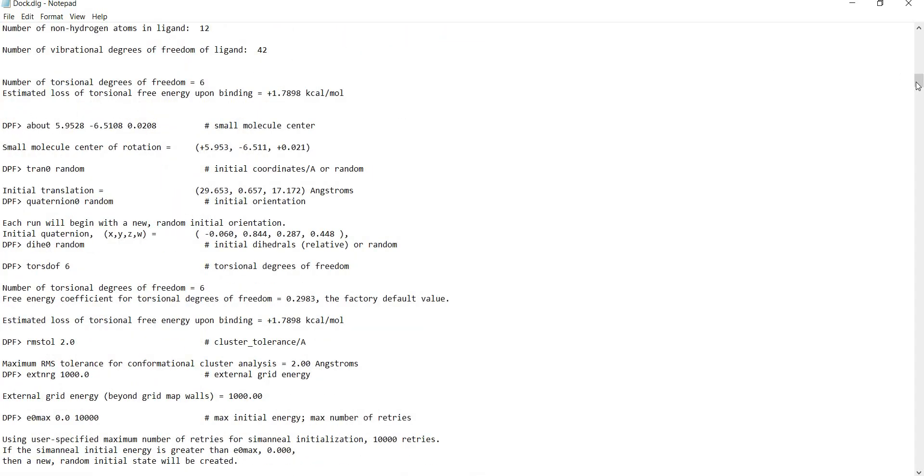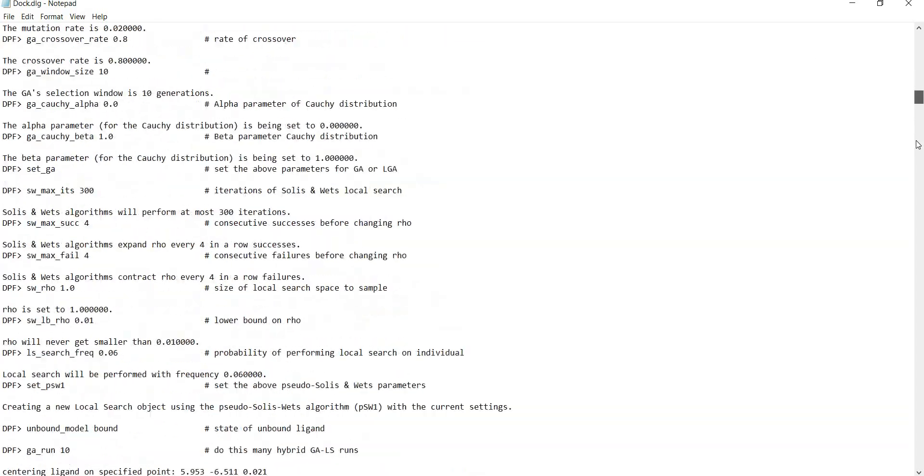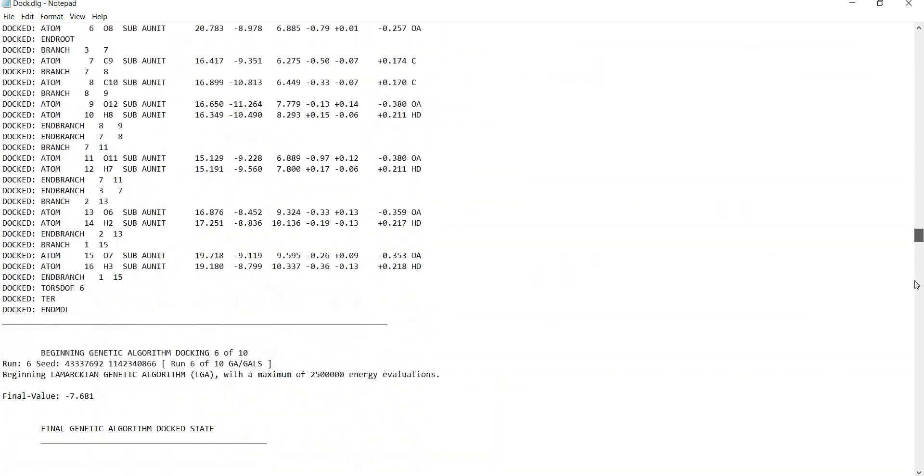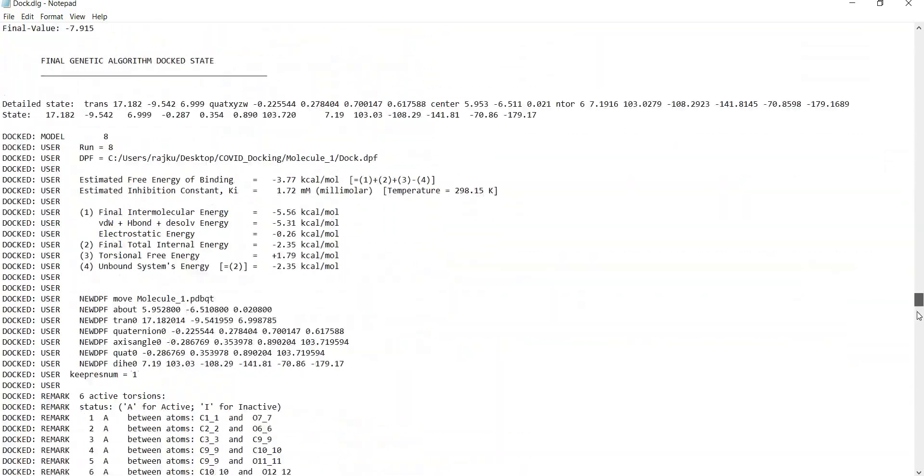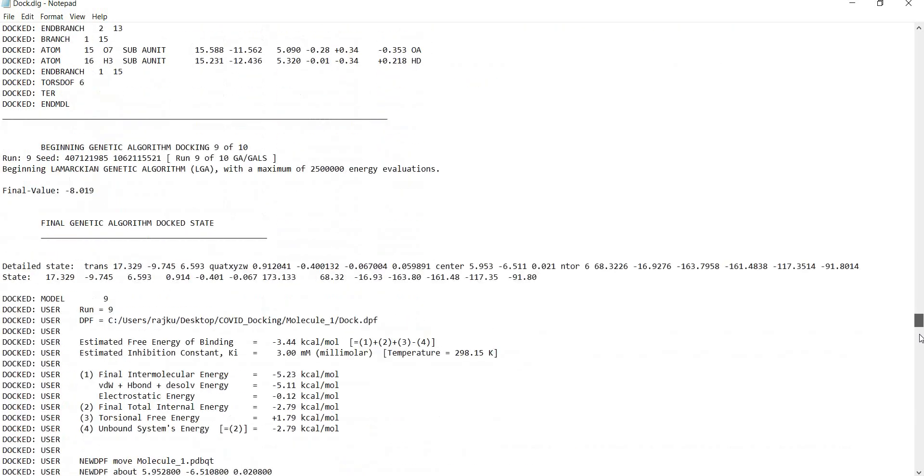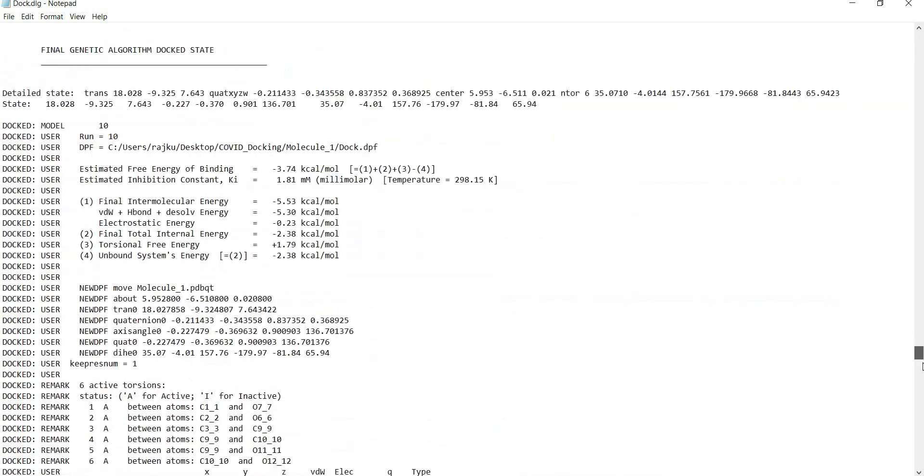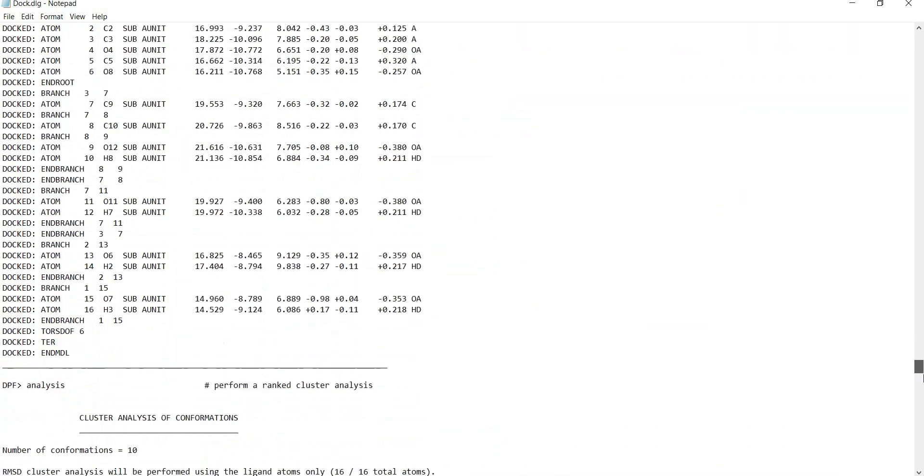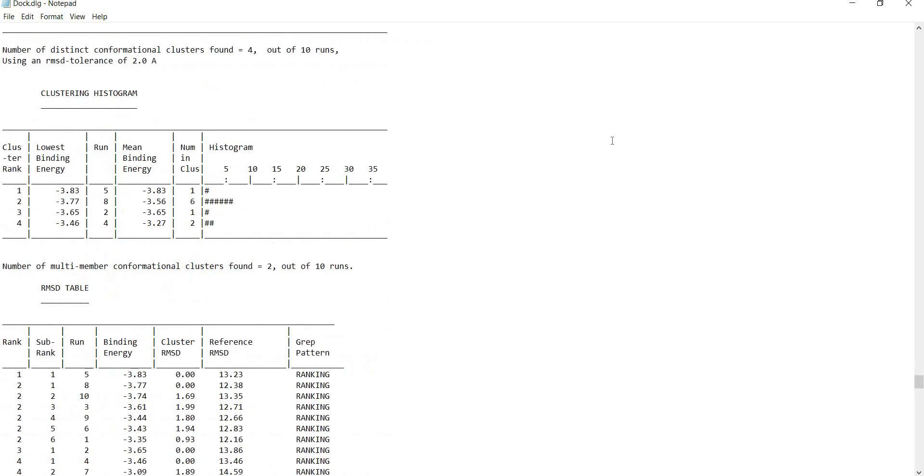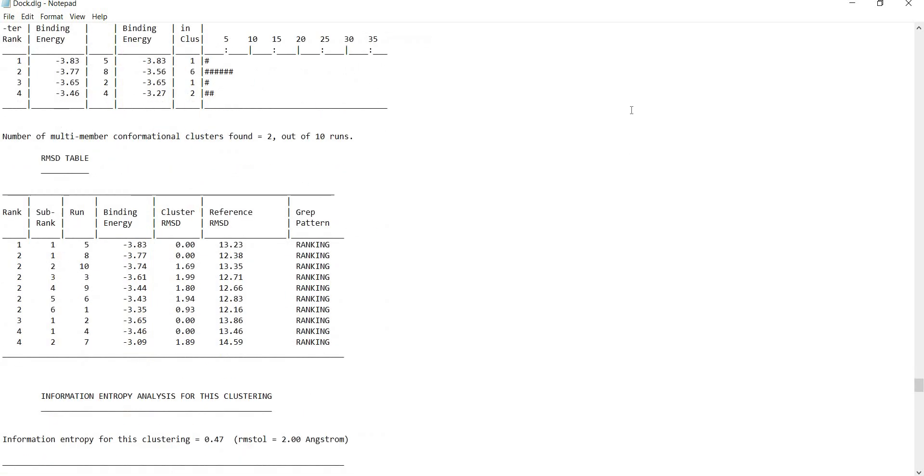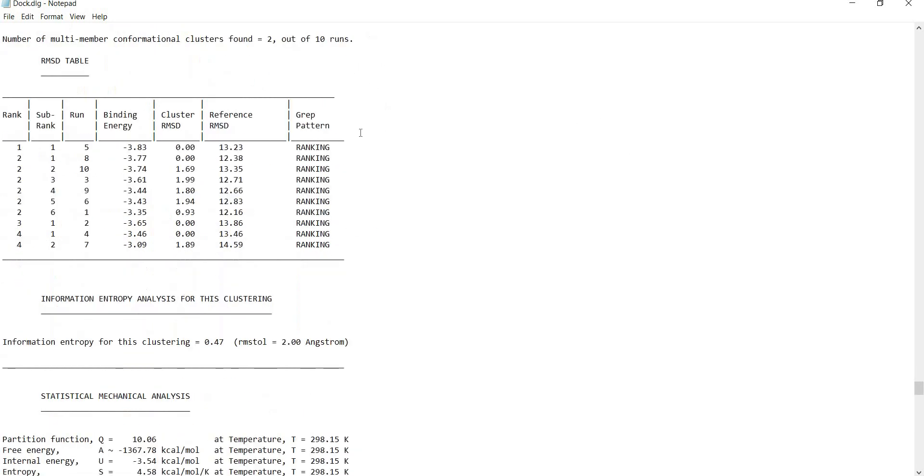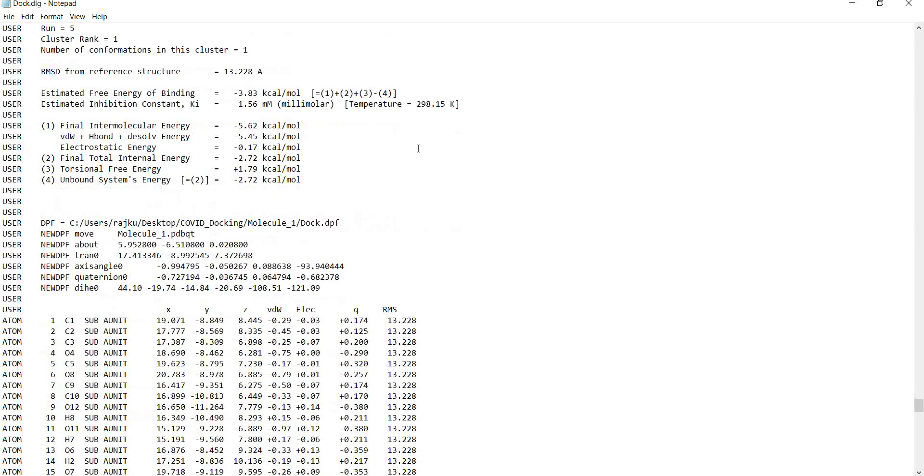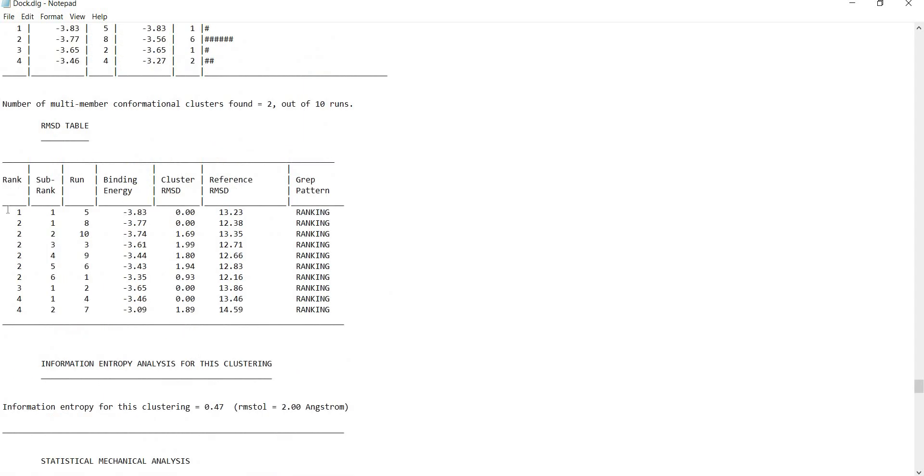You should go right towards the end. There are a lot of things because this is a log file. You can see here this is the actual result where there are several poses which were obtained with their binding energy.